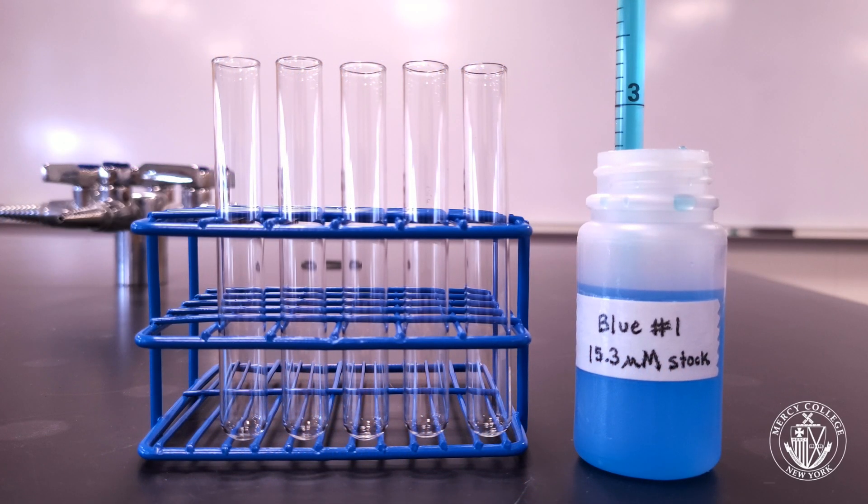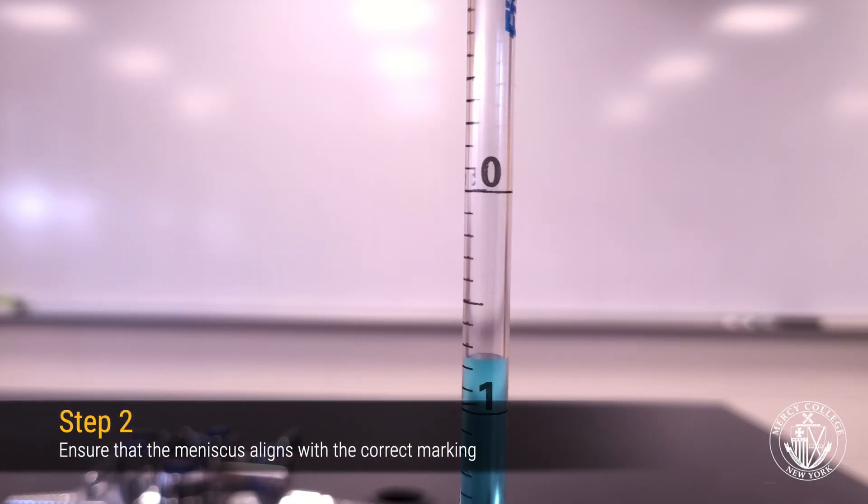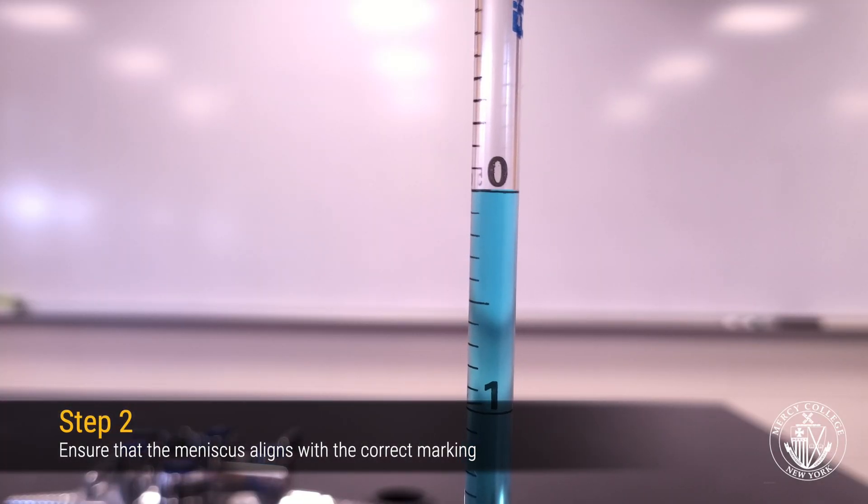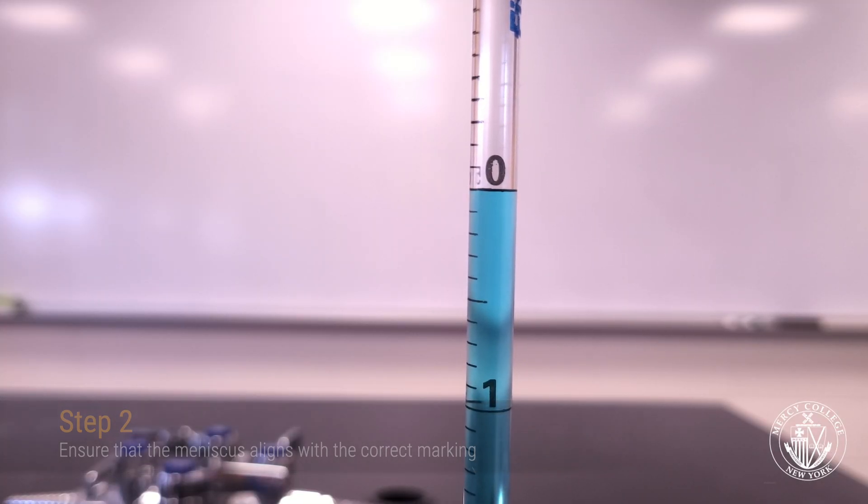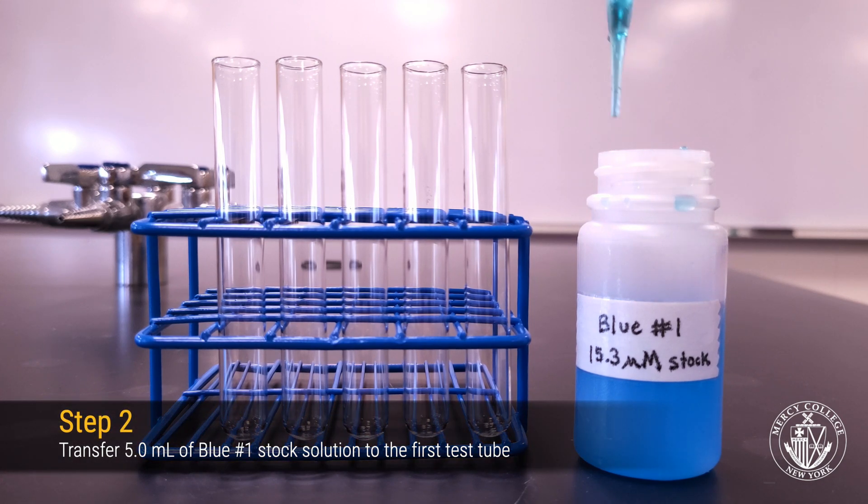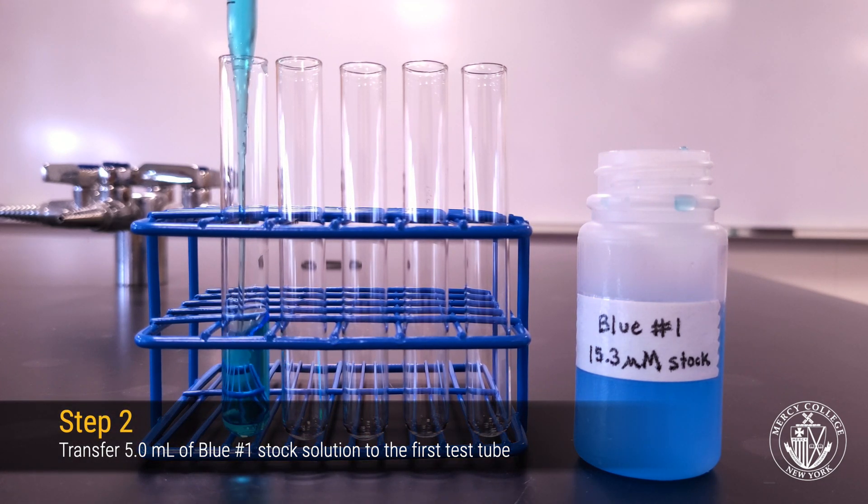For your first standard, draw up 5 milliliters of your blue 1 stock solution, making sure that the bottom of the meniscus aligns with the calibration mark on the pipette. Then transfer the solution to your first test tube.